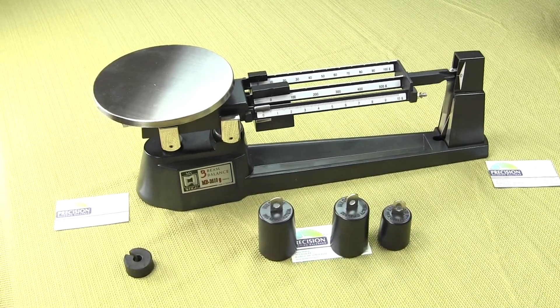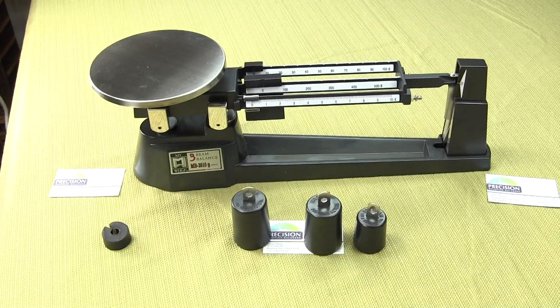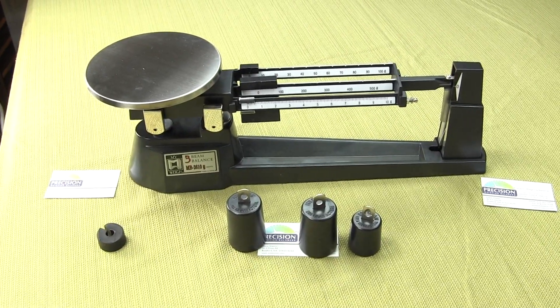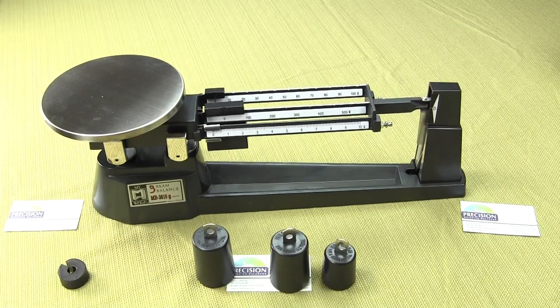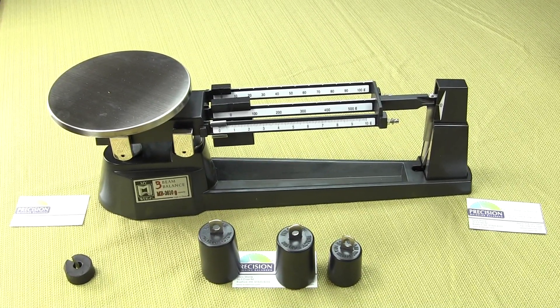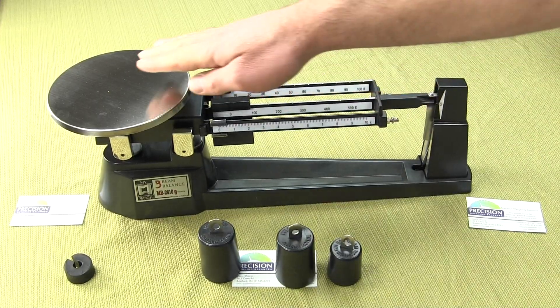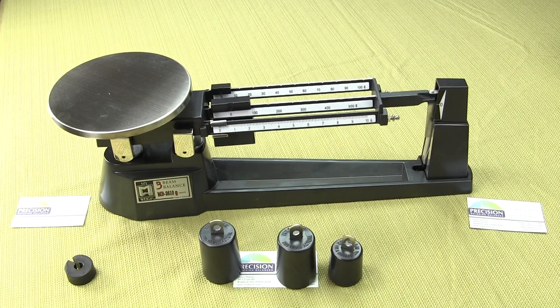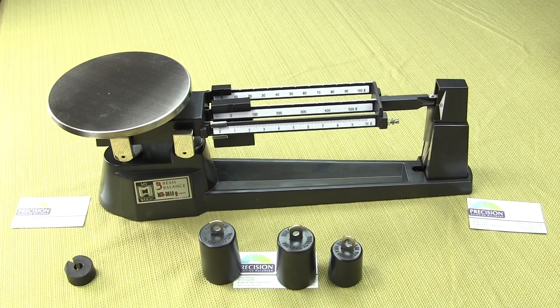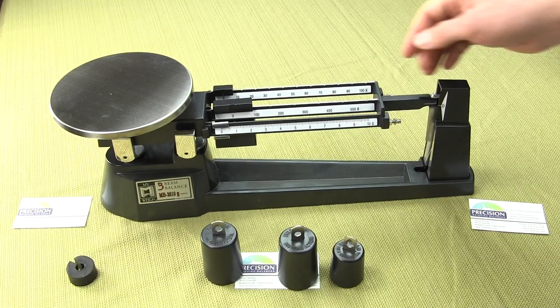We're going to discuss some of the features and how to set up the three beam balance. The triple beam balance measures mass of an item, and mass is defined as a measurement of how much an object is pulled down by gravity. We have a pan here and there's three beams. The triple beam balance got its name because of the design of the three beams.